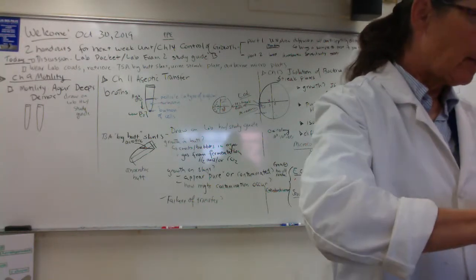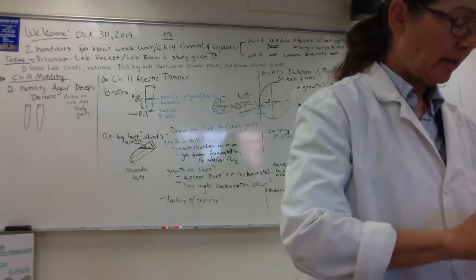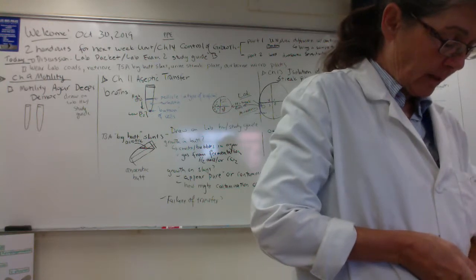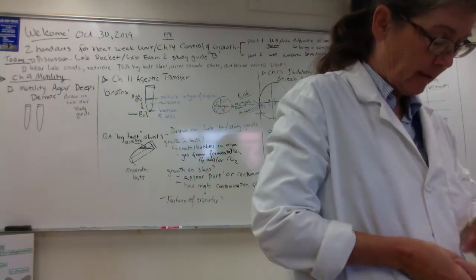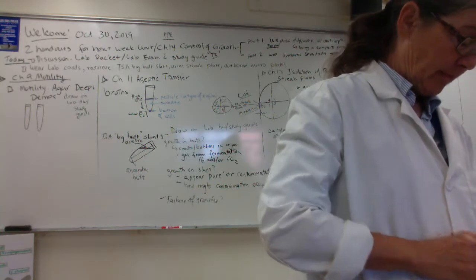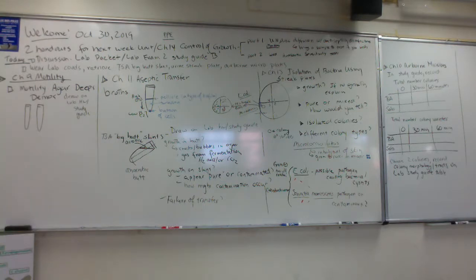And then, folks, here's the Sabouraud dextrose agar, 0-minute negative control. And let's see if it's looking sterile. See if our autoclave is working. And folks, what do you think? This is the Sabouraud 0-minute exposure, negative control.